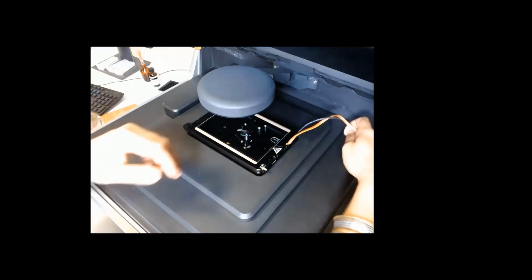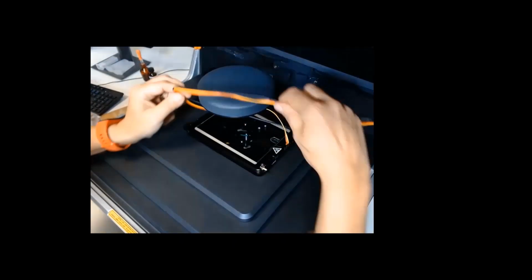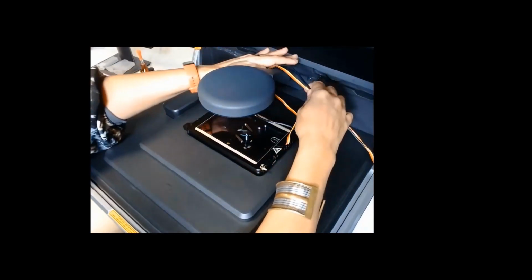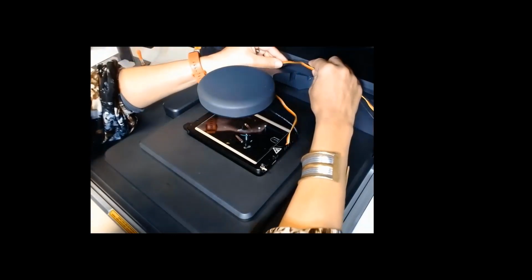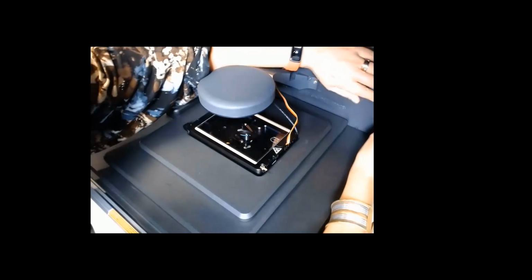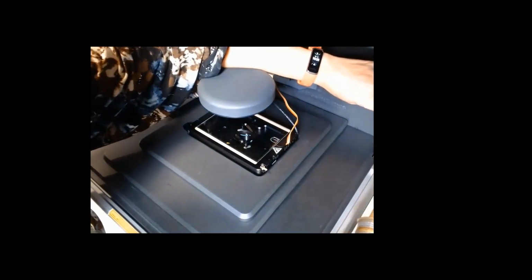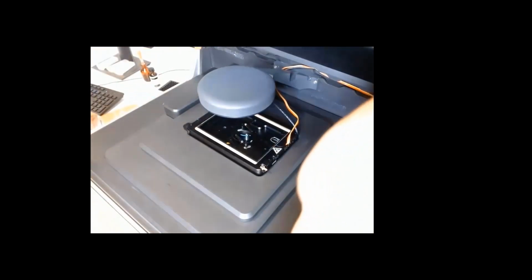Once you have the incubator on, you need to route the cables, and to do this you can do it towards the right hand side or towards the left hand side, whichever is better for your settings. So you route it through this over here, you open the orange ears and you put it here, and then you can close the system for acquisition.